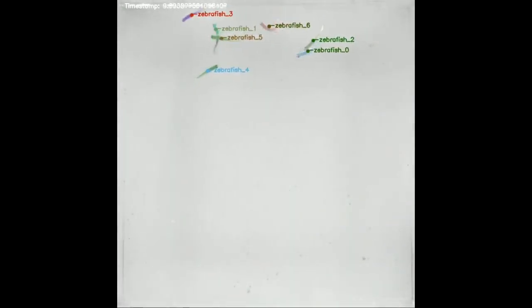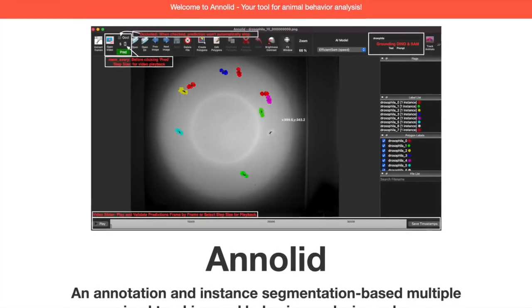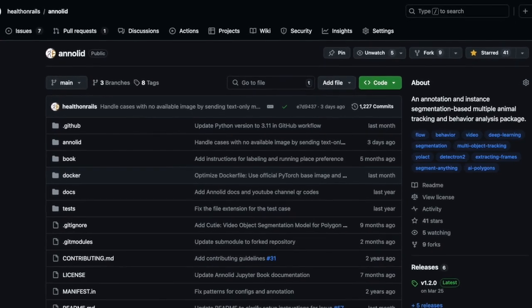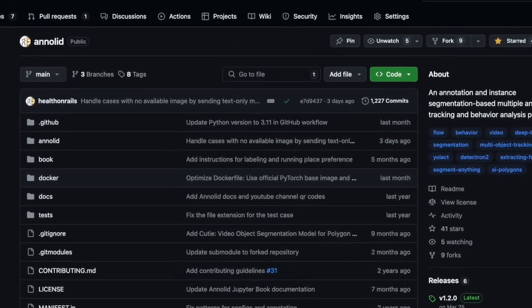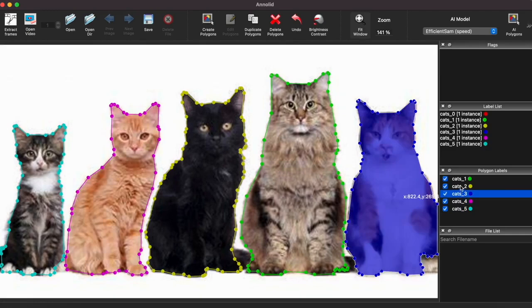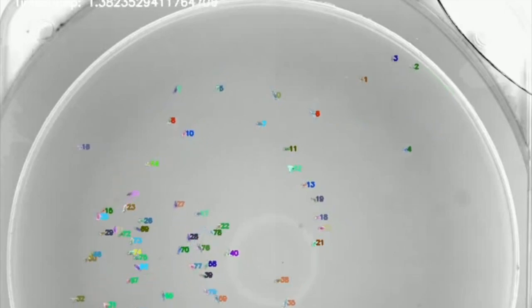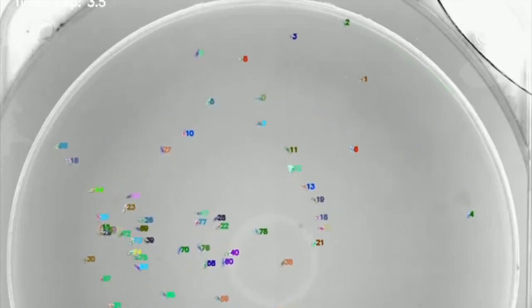This is fascinating. But how does that collaboration actually work? The source material mentions something called human in the loop. What does that mean in practice? Human in the loop means Annolid isn't just a black box that spits out data. Researchers can interact with it in real time, adjust predictions if they're off, correct the outlines if needed, and even restart the process if something goes wrong. So it's about giving researchers the tools to fine-tune the analysis and make sure the data is accurate. Exactly. It's a partnership where Annolid does the grunt work, but the researcher is still in control.